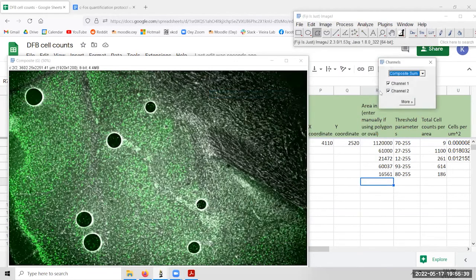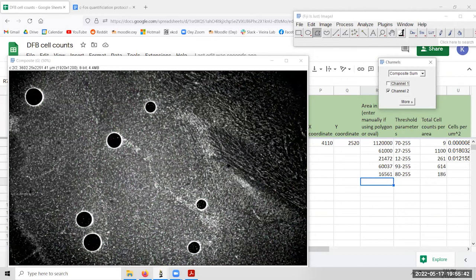Image, color, channels tool, turn off channel one. So we drew central amygdala around here. Medial amygdala then would be in the remaining portions. So we're going to set that to be about throughout here, down through where the image is basically off the edge. And I'm going to just cut it up to here where we have the basolateral amygdala a little bit more apparent. Okay. There we go. Let's stretch that up to there and move you over there. Good. So this will do.